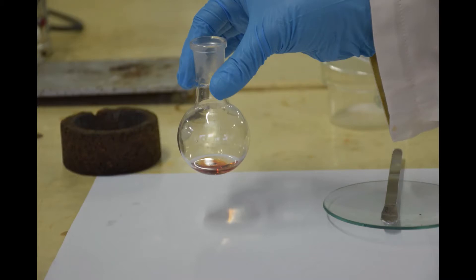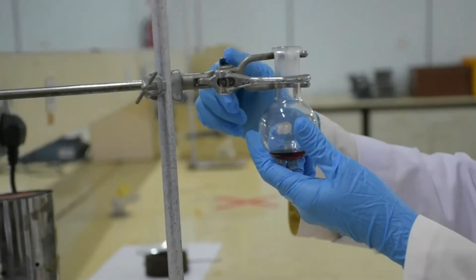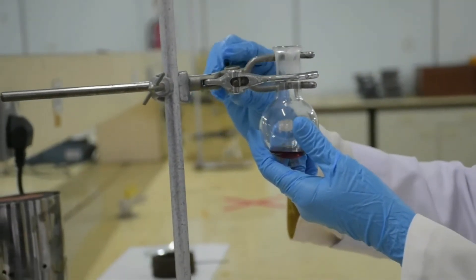This is the mixture of iodine and diethyl maleate. Clamp the round bottom flask and add boiling chips into it.